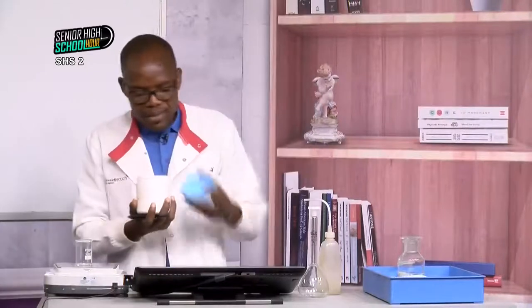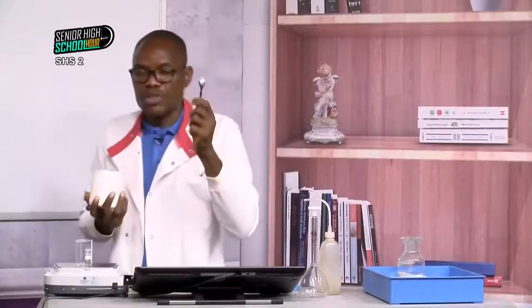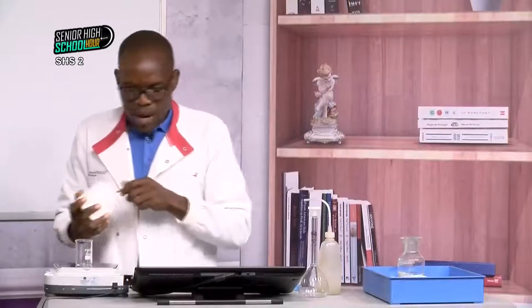Next, I place in the substance. I have my spatula here, like a spoon in your home. Anytime you want to remember the spatula, it's like a spoon. There are some where both sides are flat, but this one is like a spoon. So what mass do I need? I need 2.65 grams.